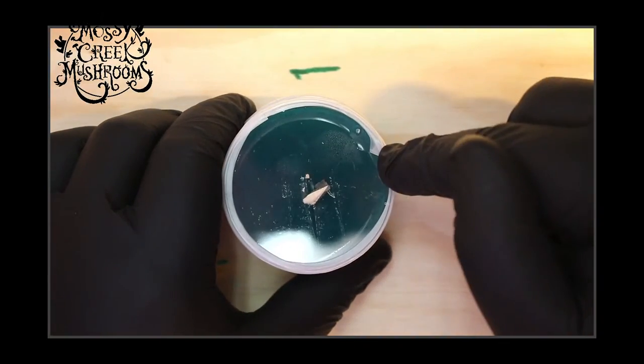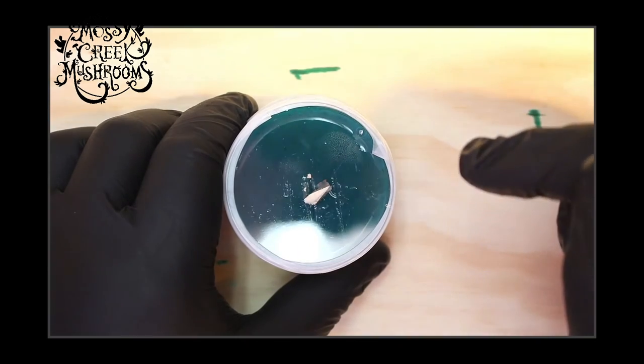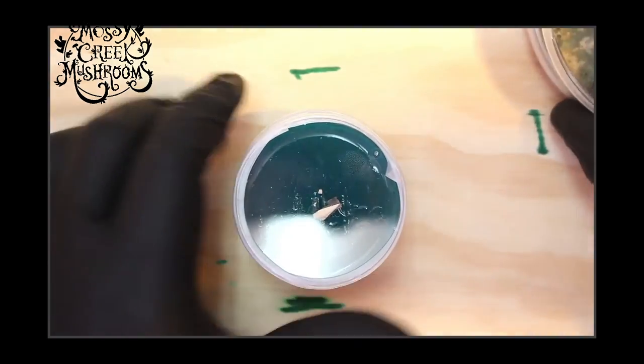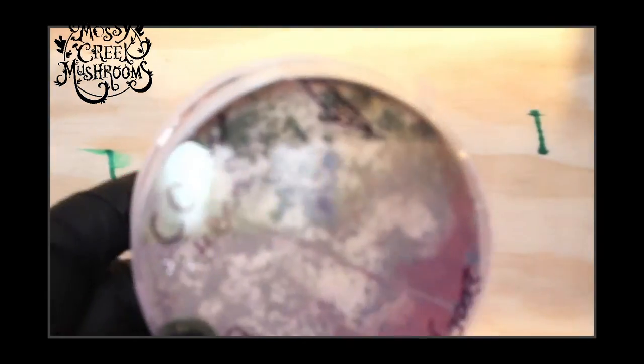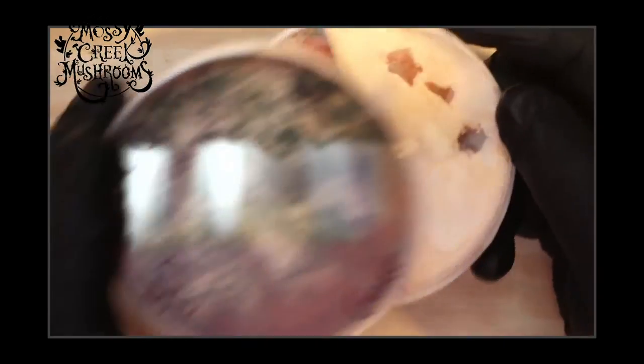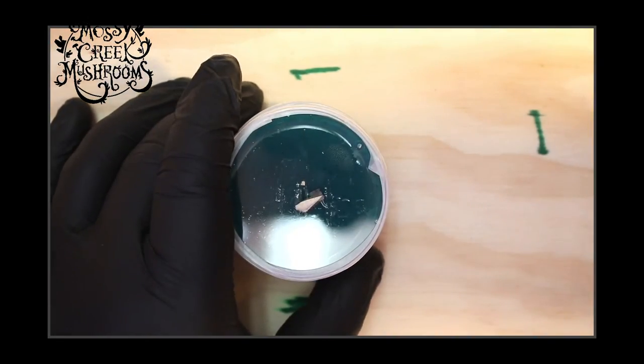So there's Chicken of the Woods — this is a wild clone we've gotten from the local woods here. Ben Erickson found it. That plate you saw — these are the only two plates that have ever existed of this strain until today. And now there are five plates. We're trying to save this strain, as dirty as it was.